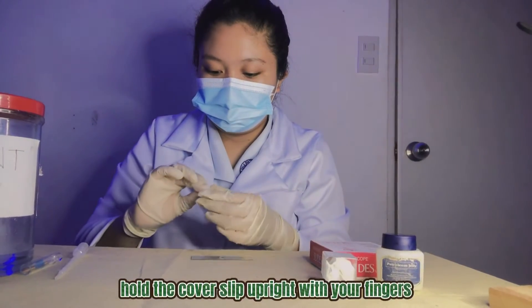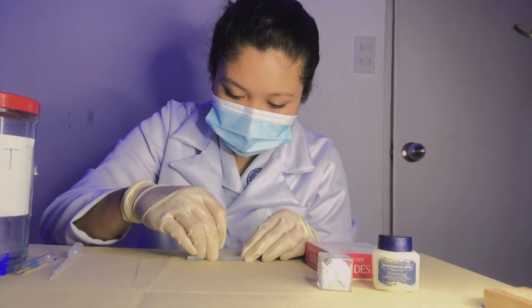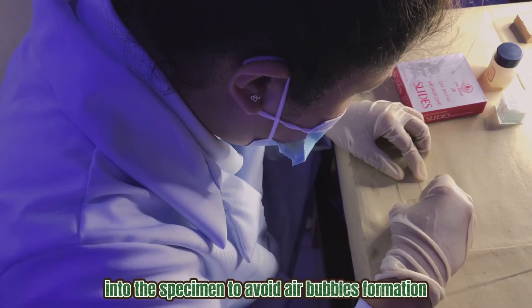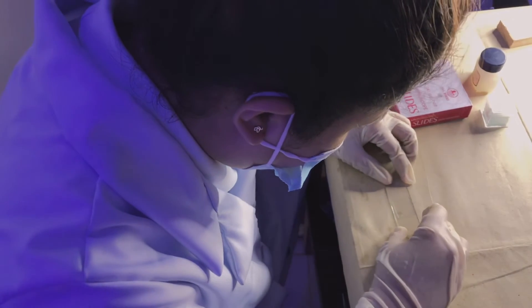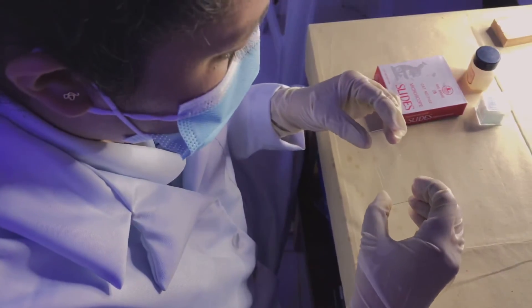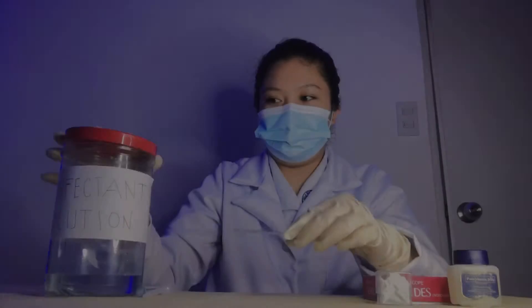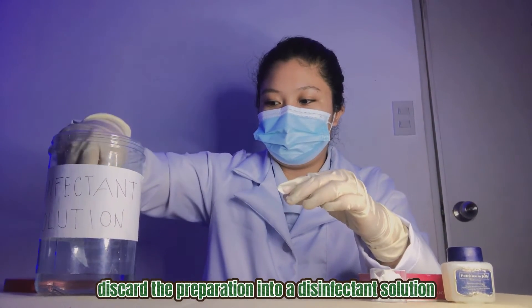Hold the cover slip upright with your fingers. Slowly lower the upper edge of the cover slip into the specimen to avoid air bubble formation. This is the finished wet mount preparation. Discard the preparation into a disinfectant solution.